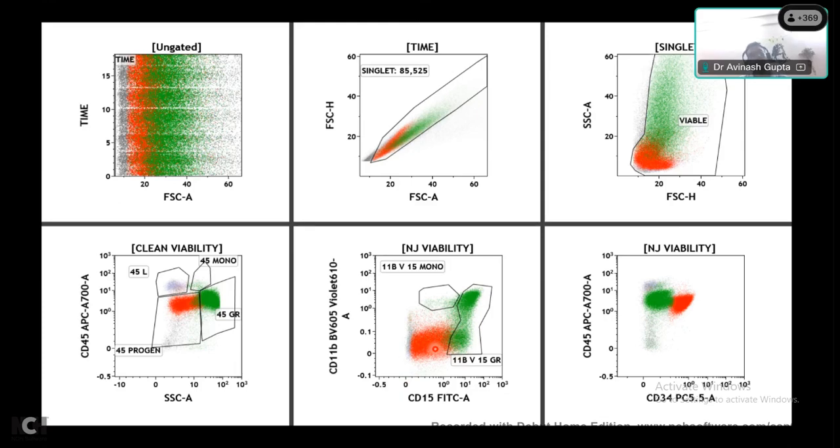And the blast number or percentage is already increased. So marrow with increased blasts, presenting with bicytopenia, peripheral blood having blasts, blasts are MPO positive, and then they are positive for CD34, dim for CD45, low side scatter, and also showing CD15. So this is going in the direction of abnormality. So these are the abnormalities.